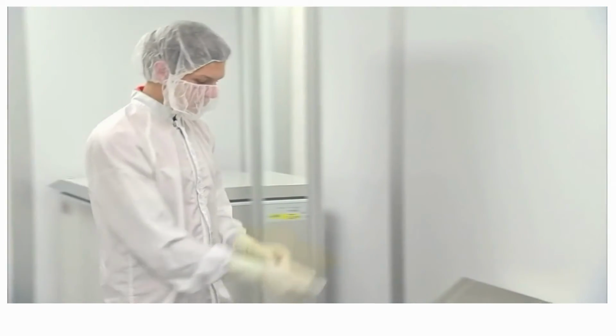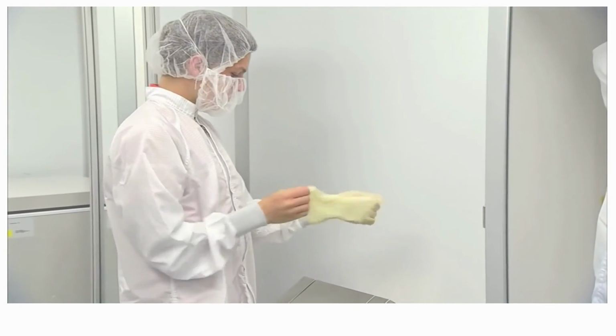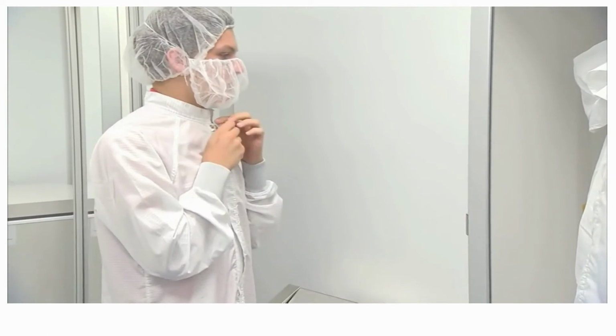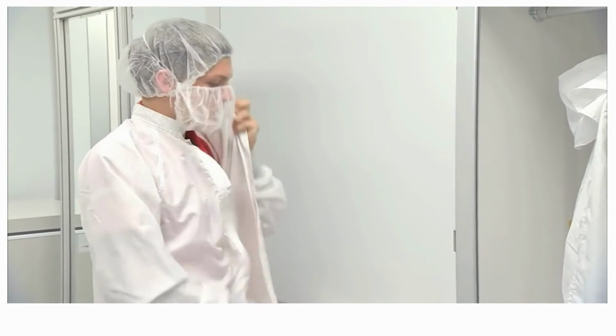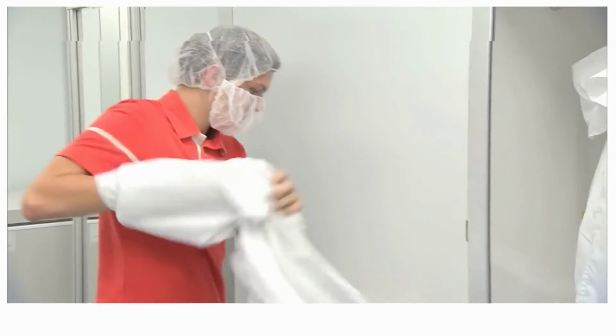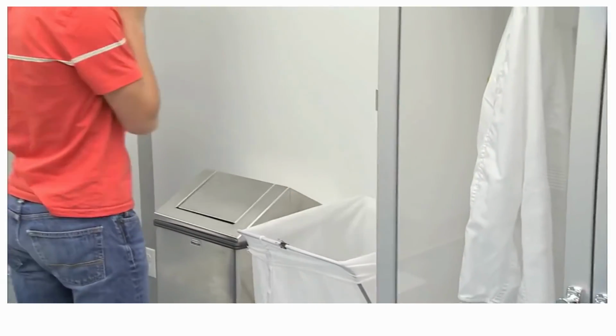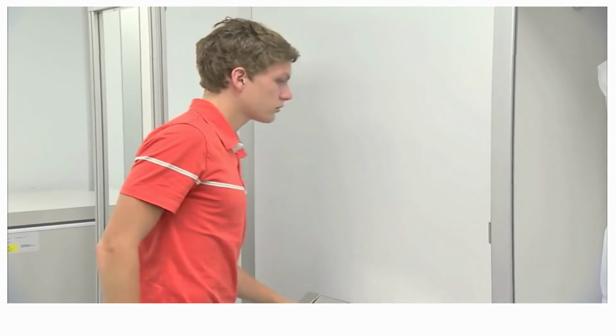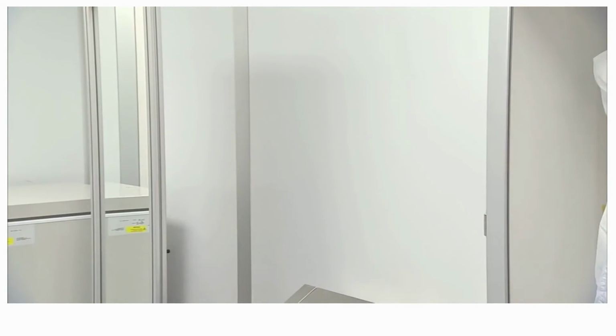Take off your gloves and dispose of them in the proper receptacle. Remove your smock. If you are only leaving the cleanroom for a short period of time, you can hang your smock in the cabinet. If not, place your smock in the hamper so that it may be washed and reused. Remove the face mask and bouffant cap and dispose of them as well. Finally, exit the cleanroom, take off your booties, and throw them away.